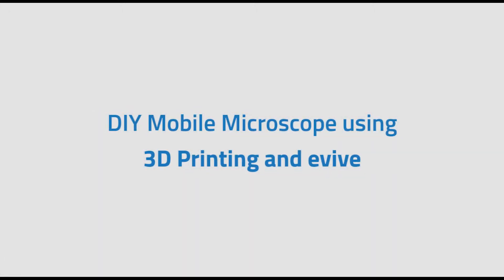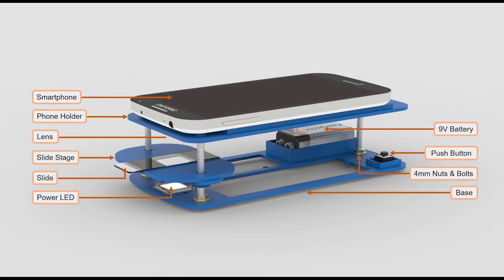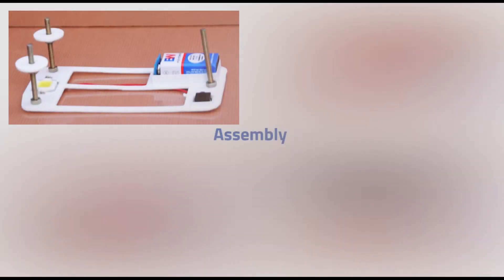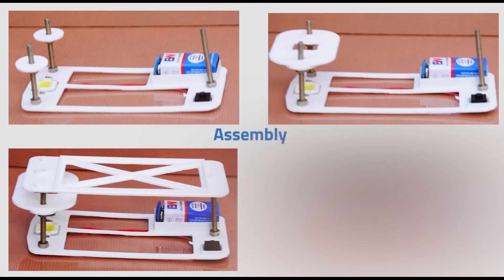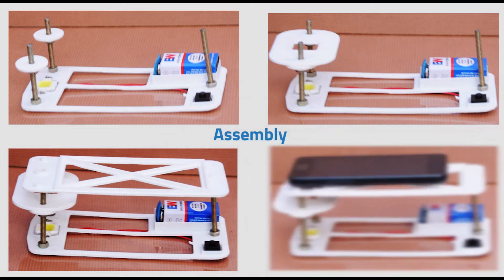This video will take you through the assembly and implementation of a mobile microscope made using 3D printing and E-Vive. This is a smartphone-based microscope which provides high magnification video through its inbuilt camera with an additional lens.